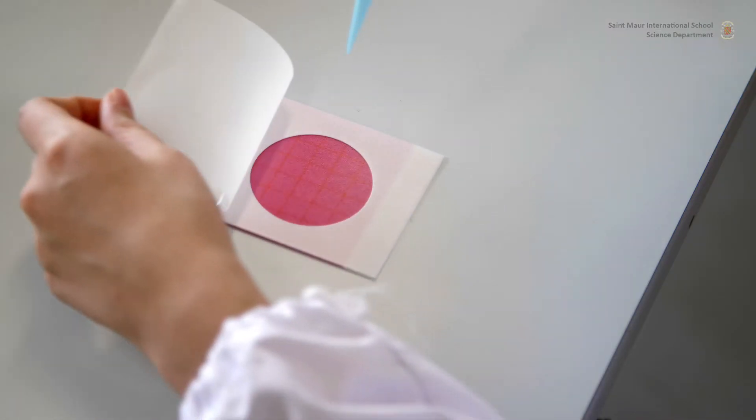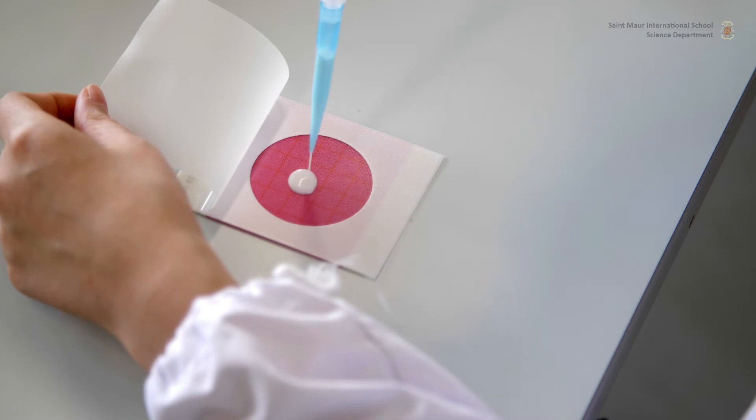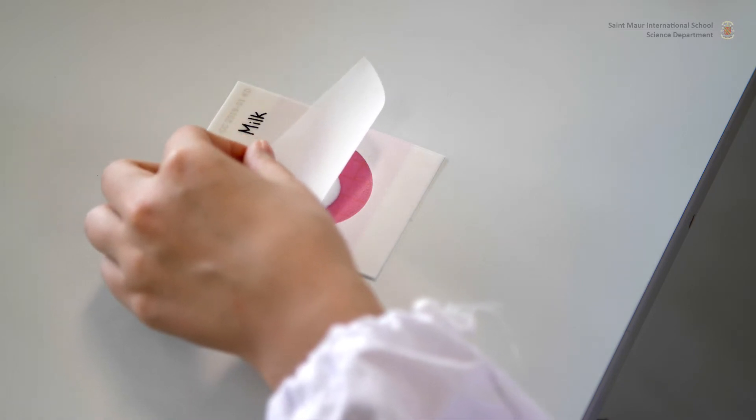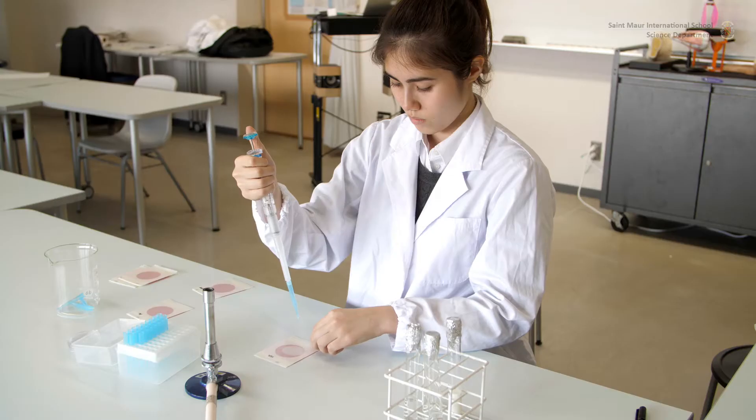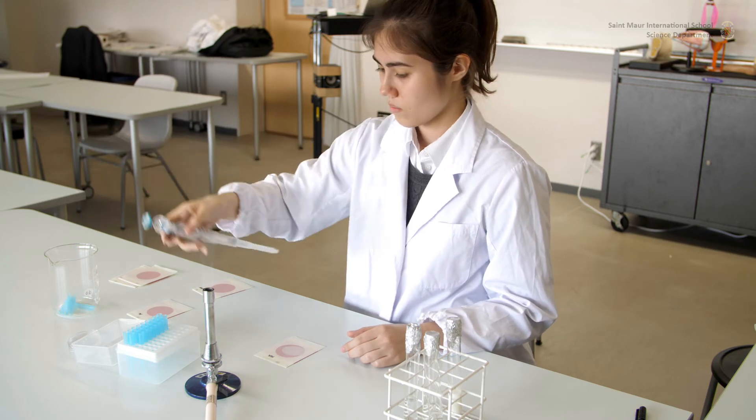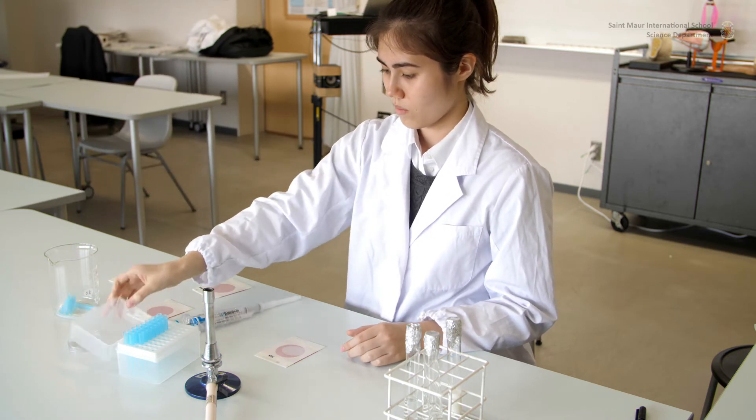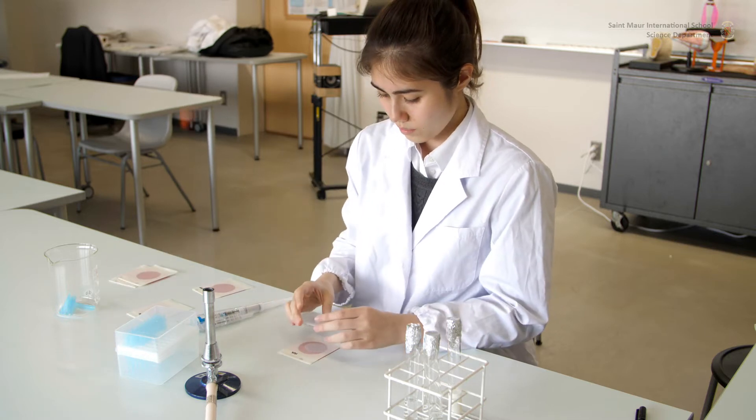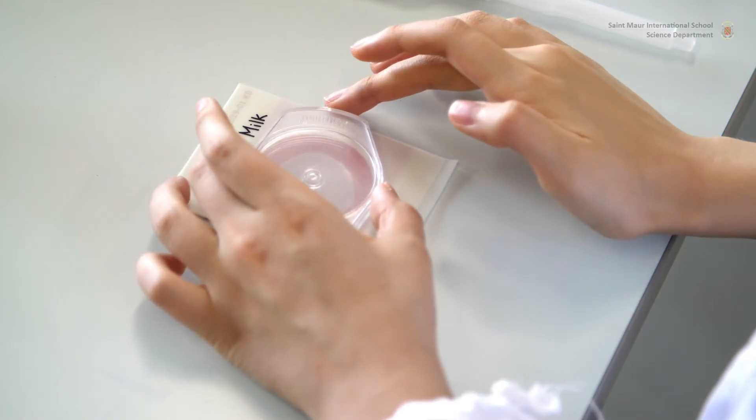For liquid inoculum, lift the cover and pipette 1 milliliter directly on the surface of the petrofilm. Place the cover back on and use the spreader to distribute the inoculum load evenly.